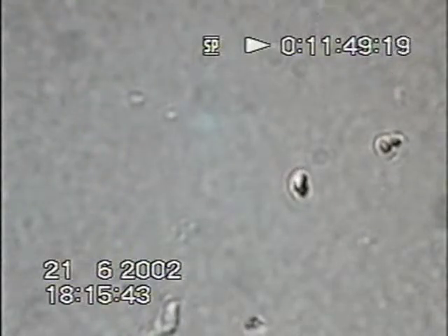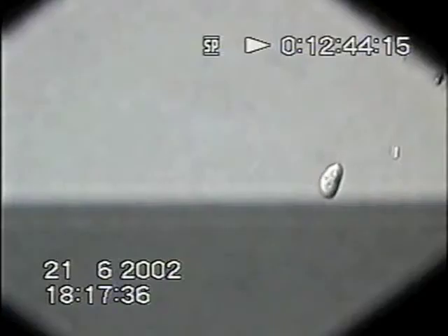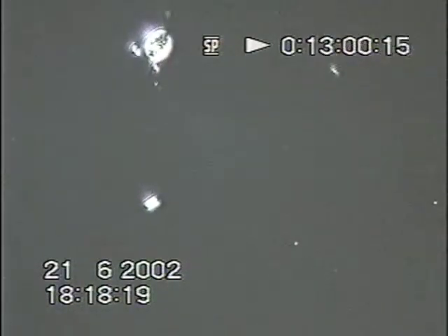Let me try the 40. You could see its flagella there. Tail on it. Now here we have this organism being furiously motile with a flagellum. It's almost suggestive of a root or something like that. And it seems to be looking around for food.